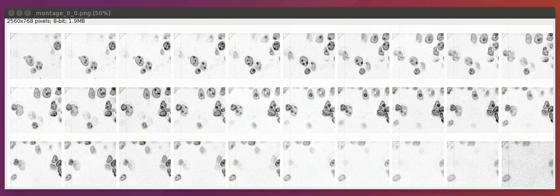Picking up from the previous video, again, the goal of this job is to identify single cells in this data set. And the end result should be giving each cell a label such that cells that are next to each other have different labels. To do this in this data set, what you will need to do is make use of the three-dimensional context. What that means specifically is you're going to have to identify the same cell in multiple frames.